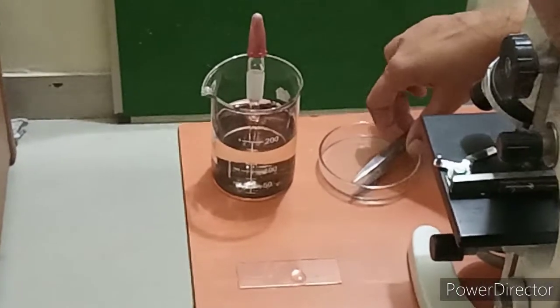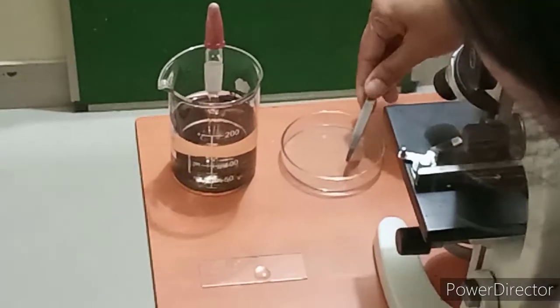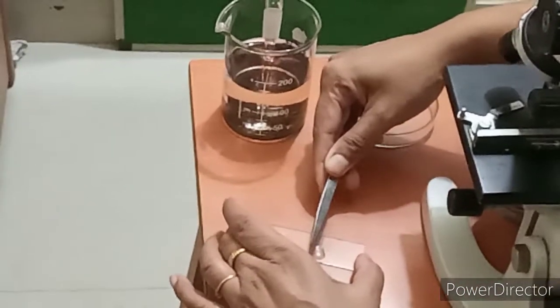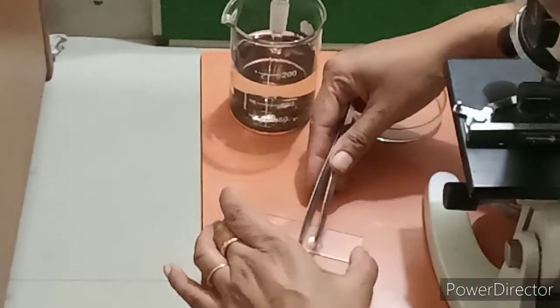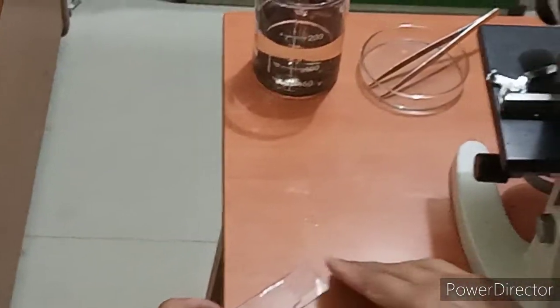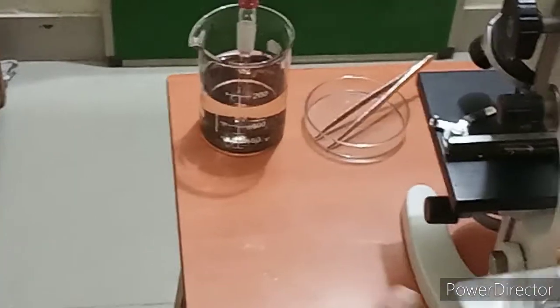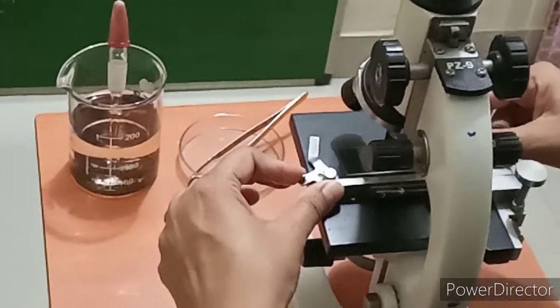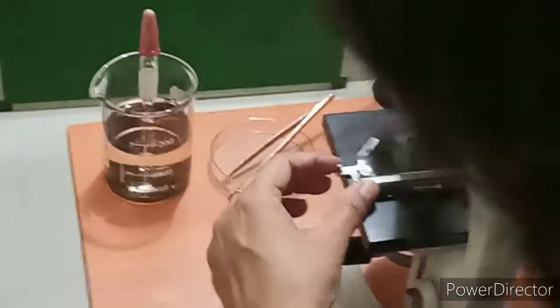So let us observe it first, because at times we see beautiful paramecium moving in the water sample. There are other organisms also which you can see moving here and there, so you feel happy after seeing those small organisms in the slide. So this way we are keeping it under low power first and observing it.